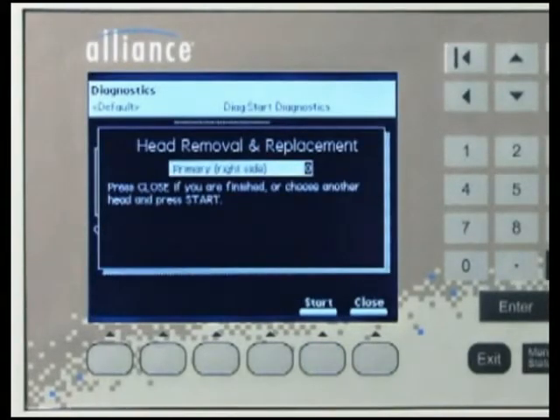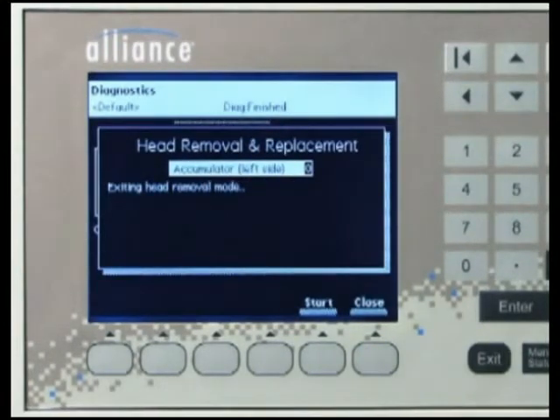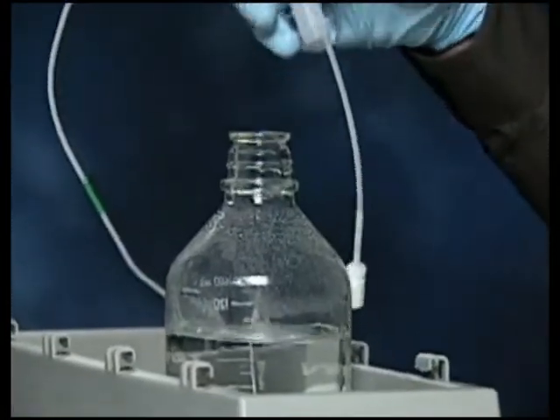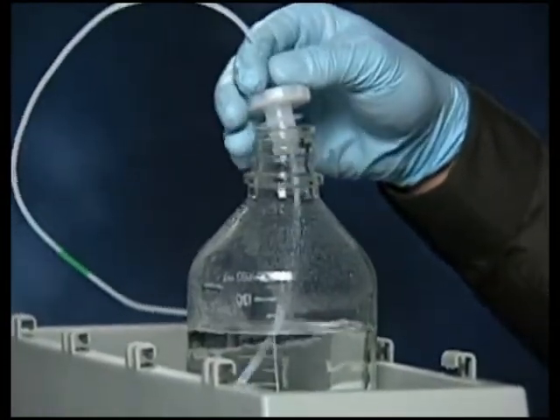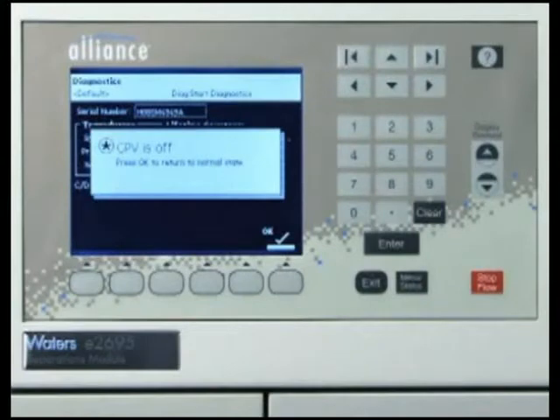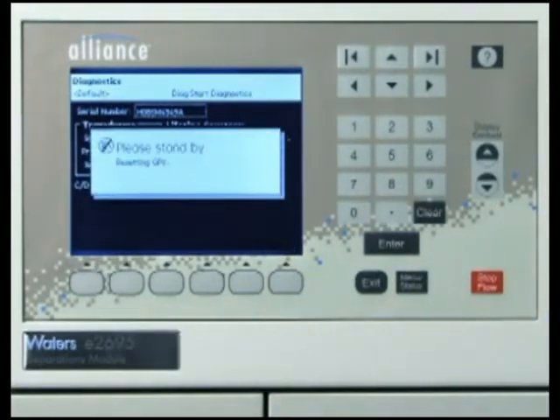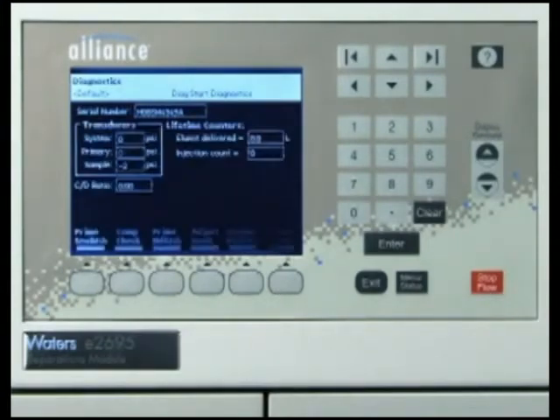Press the Continue screen key again to repeat the steps to rebuild the second head. After rebuilding the second head, press the Close screen key to exit this diagnostic. You can now replace the seal wash inlet line into the seal wash reservoir. Before continuing, it will be necessary to open the gradient proportioning valve. Press OK to return the gradient proportioning valve to its normal open state. You will be informed to stand by while the GPV resets itself.